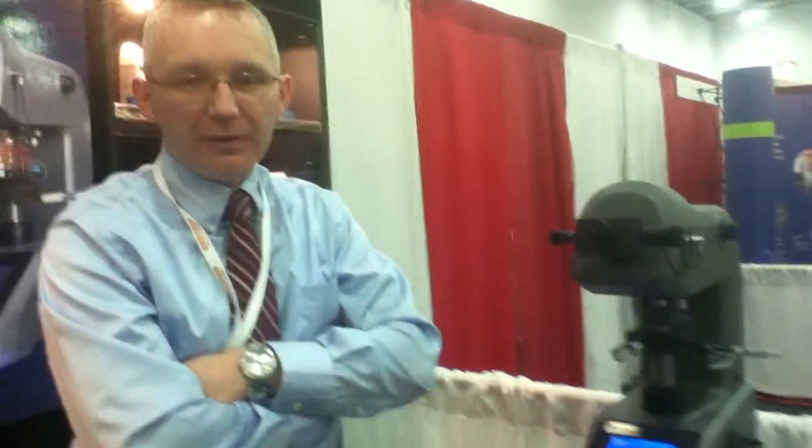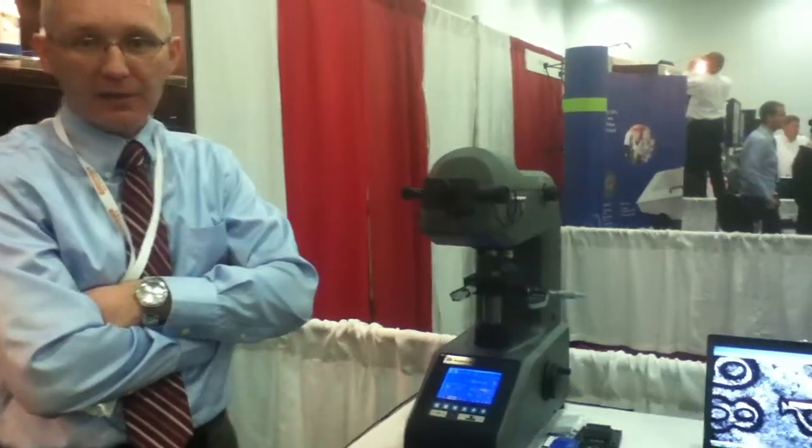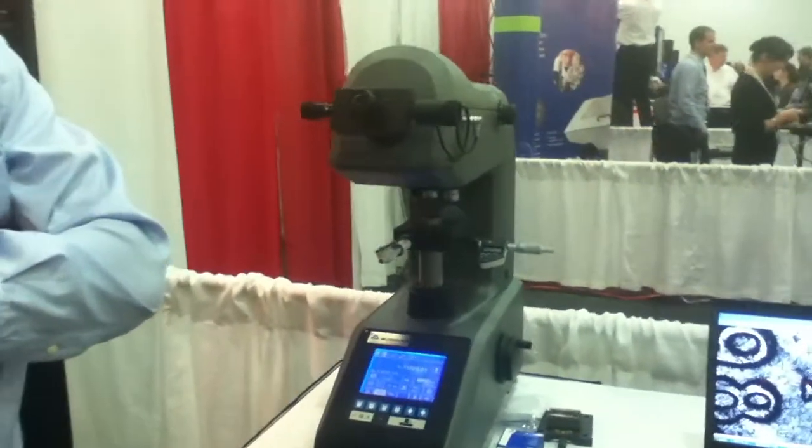The Micromet 6000 is our recently released micro indentation hardness tester. It has a load range from 10 grams to 2 kilograms. The unit can be operated in standalone or in a fully automated mode.